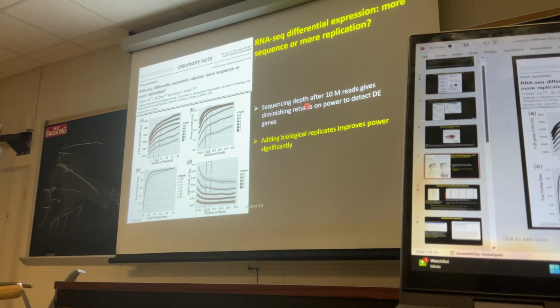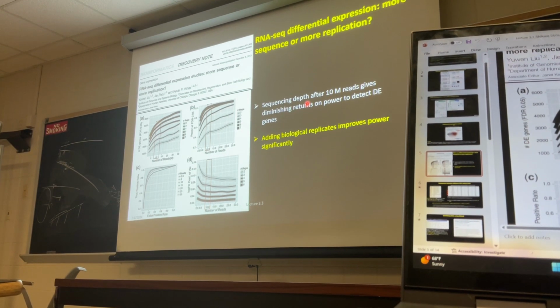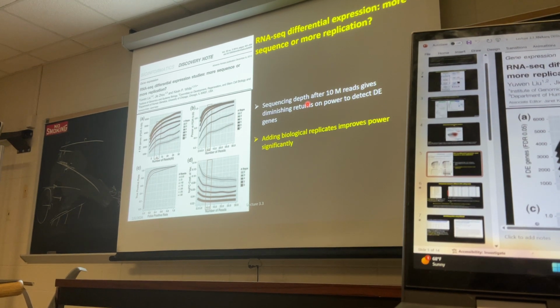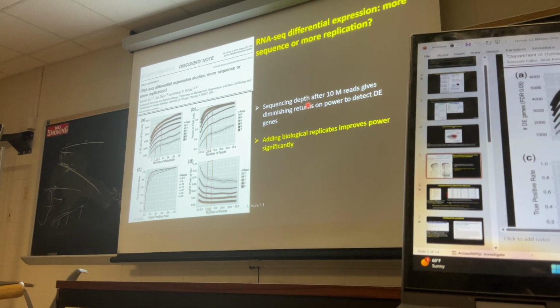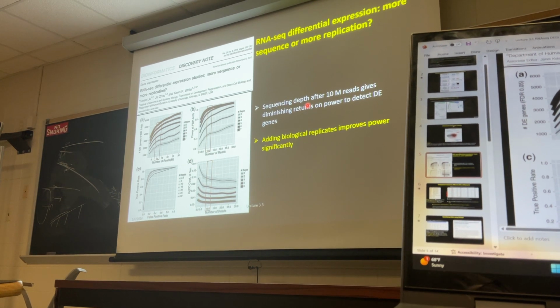How many of these flow cells you are trying to use, or how many of these lanes? In Illumina you call it a lane, but in PacBio we call it a flow cell. So how many lanes you want to use for your sample. Based on how many lanes you use, that will determine how many reads you are getting. Those are the reads ultimately going to map to your genome here, right?